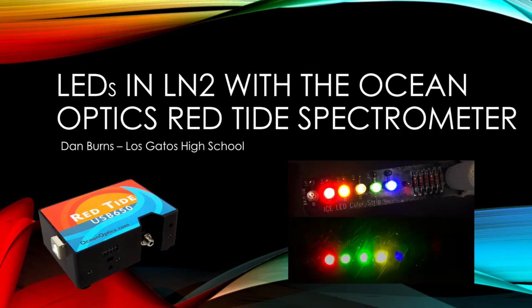And I'd like to tell you how I used an Ocean Optics spectrometer to solve a mystery resulting from immersing LEDs in liquid nitrogen. The mystery I'm trying to solve is what was observed when I immersed an LED into liquid nitrogen. It turns out that to answer this mystery, we needed our Ocean Optics Red Tide spectrometer. I've been using them for 14 years in my workshops and classroom.